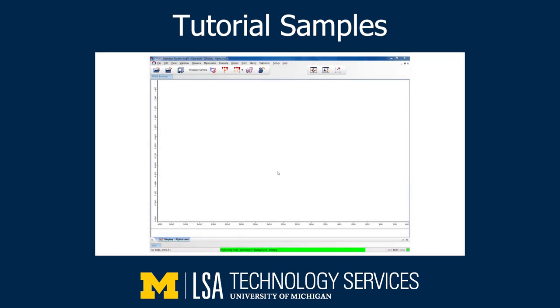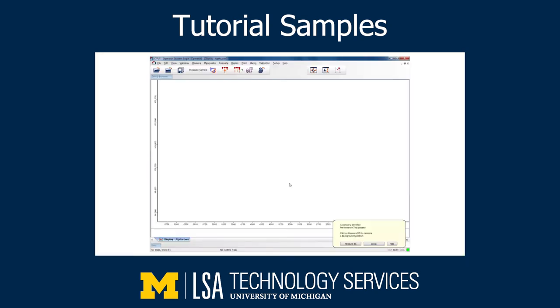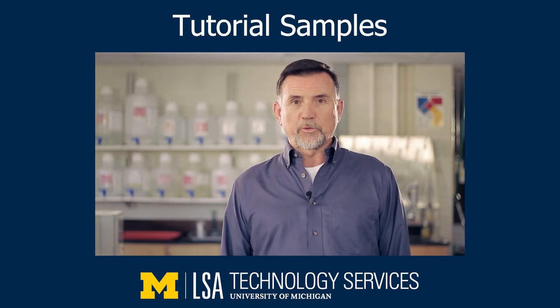Validation for the instrument will take about 1 minute. A box will appear in the lower right. At this point, you can click the Measure BG or Background box to start the process. If there's a spectra still on the screen, you'll need to erase it before you proceed.